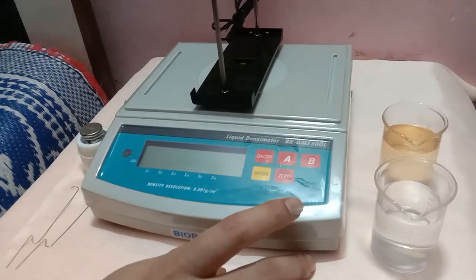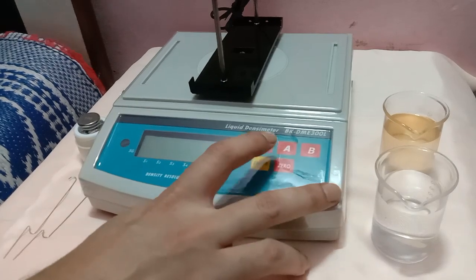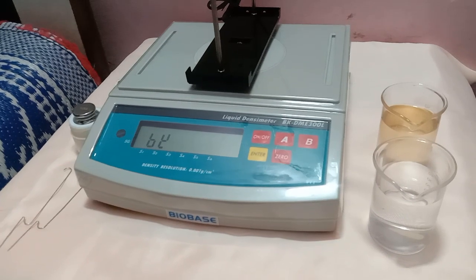This is a liquid density meter BKDME 300L. Let's start the operation on it and wait till it shows the value of 0.000.